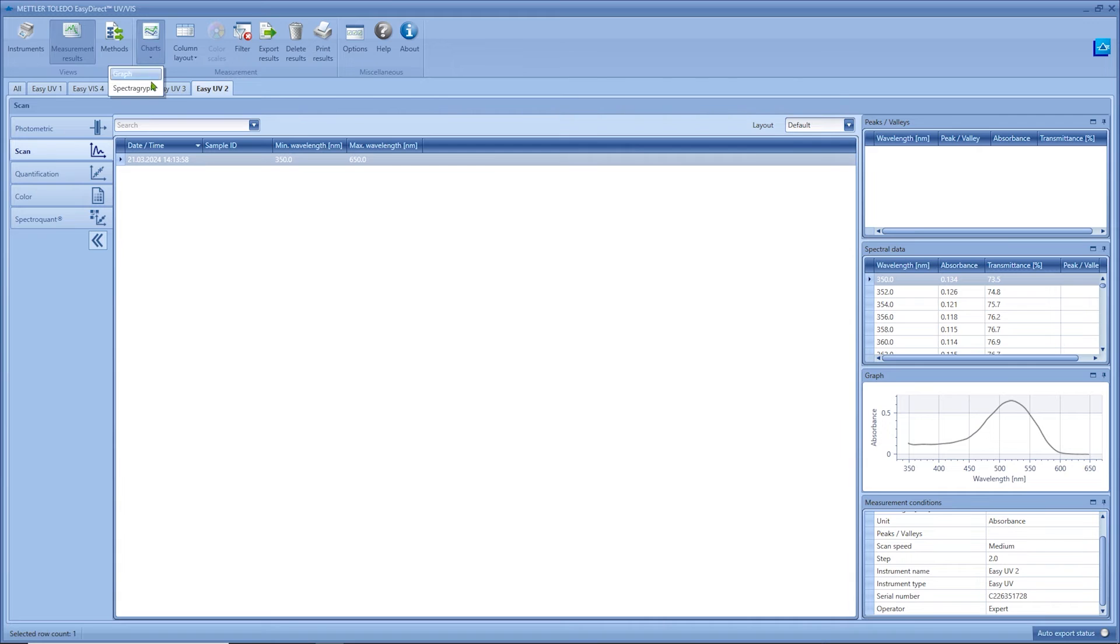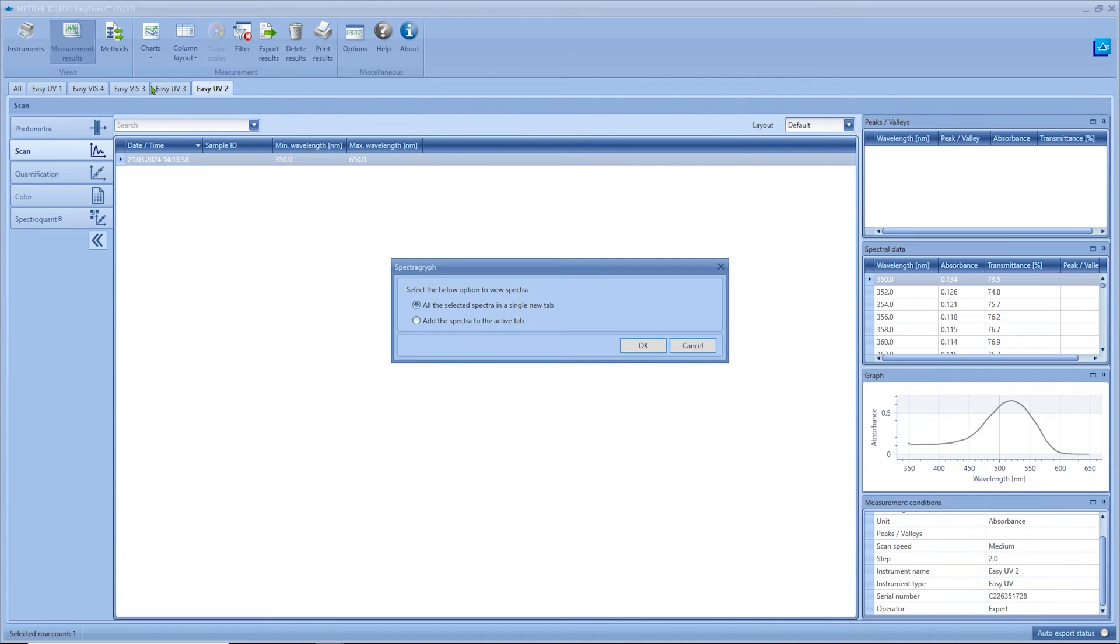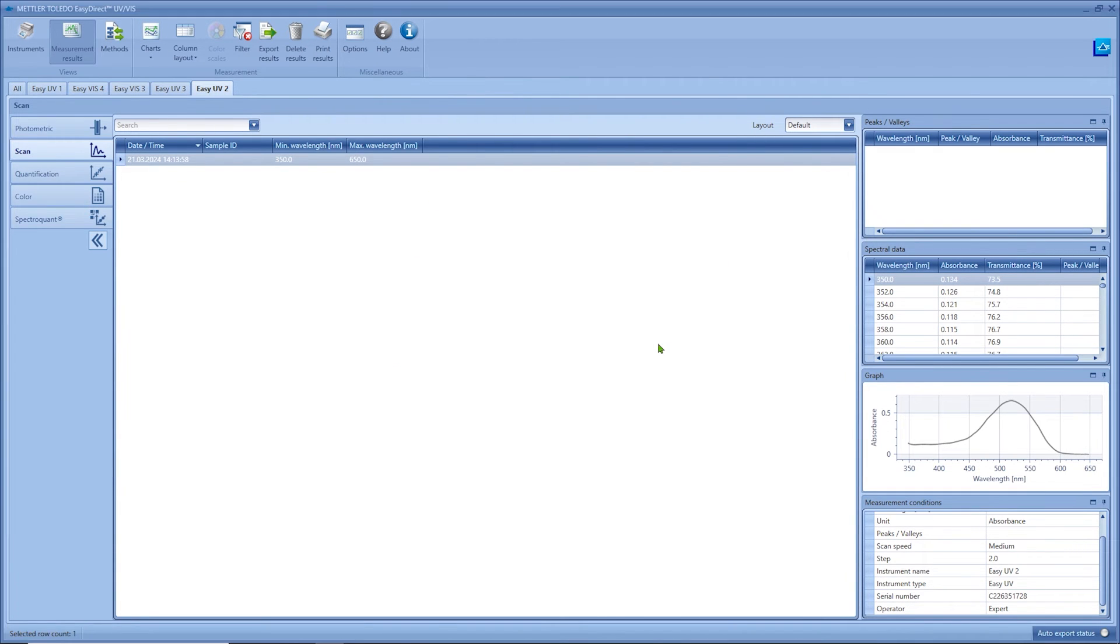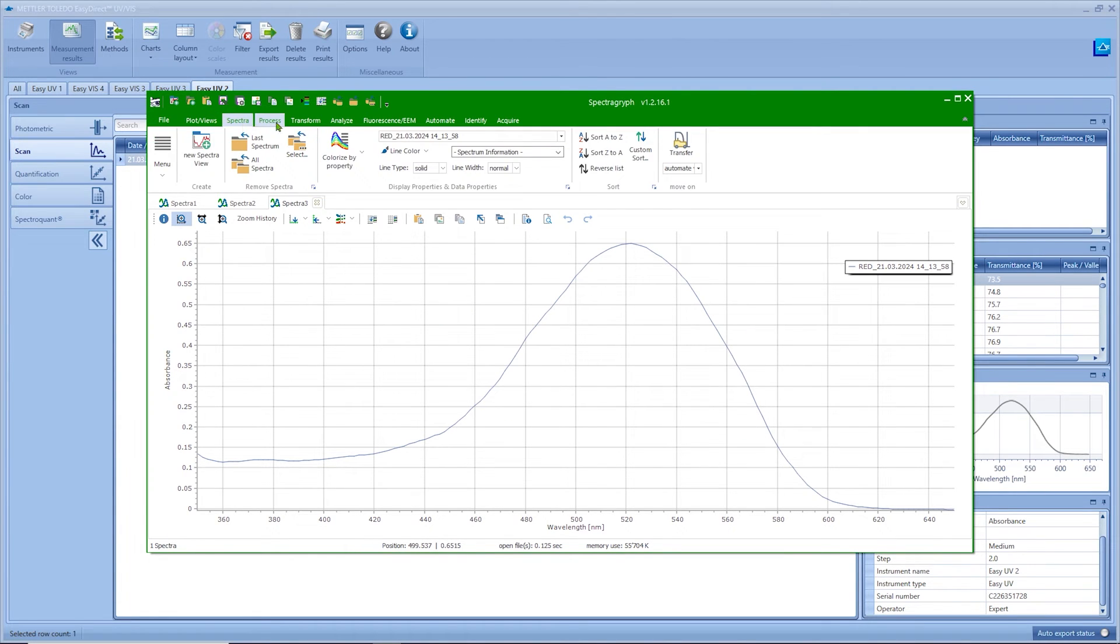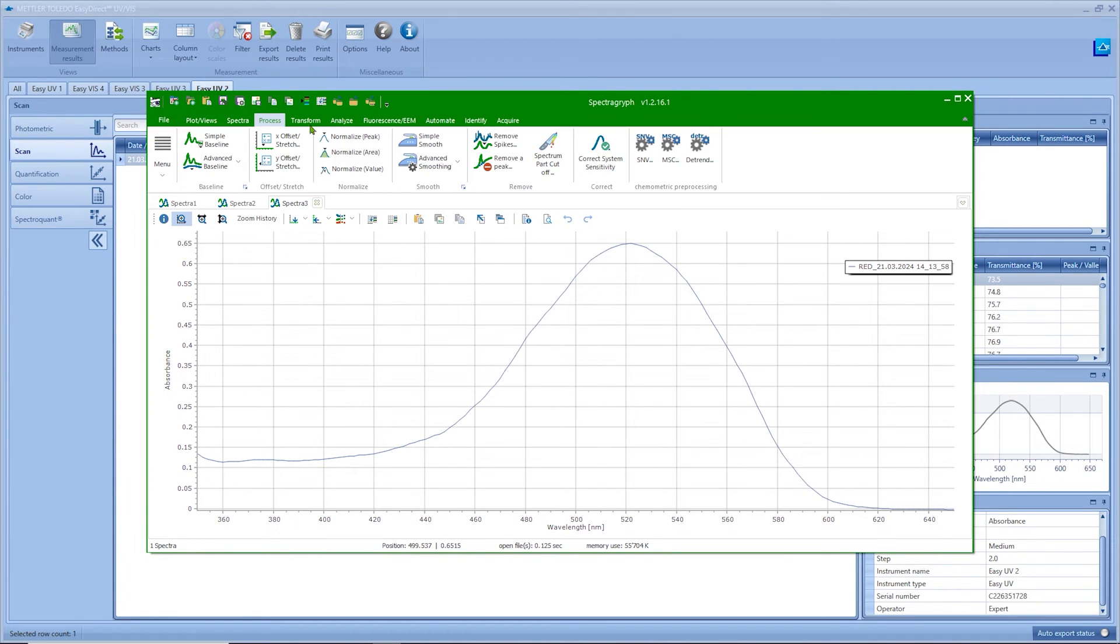With spectra grief the spectral data will be sent to an additional external software. With this spectroscopy software you can do additional evaluations like peak finding or calculating derivatives.